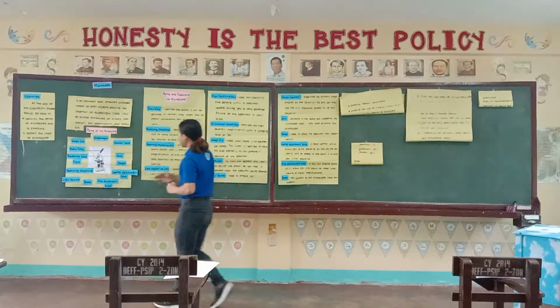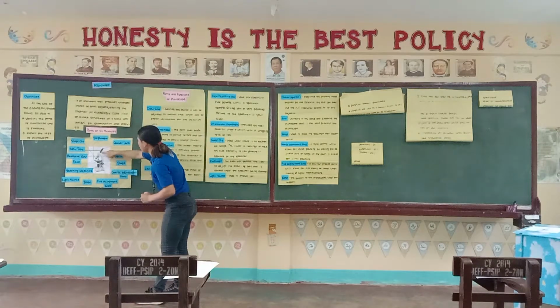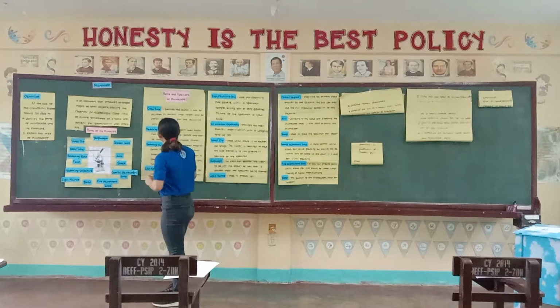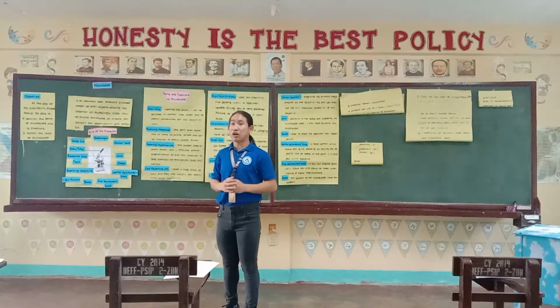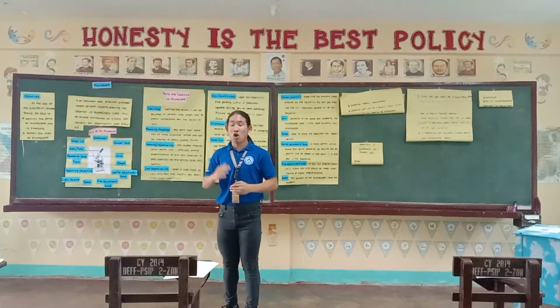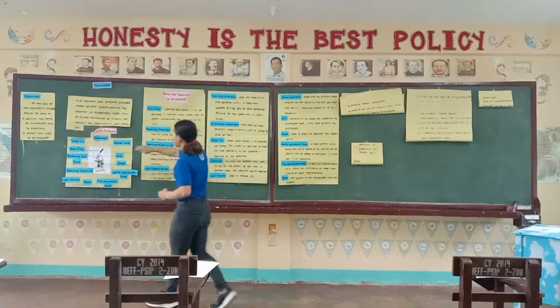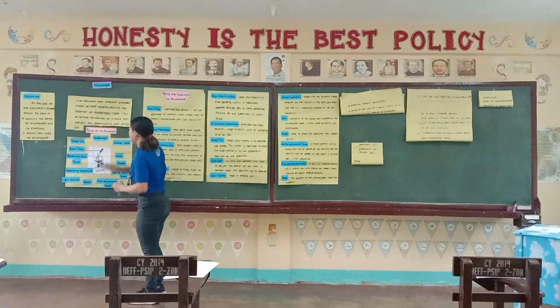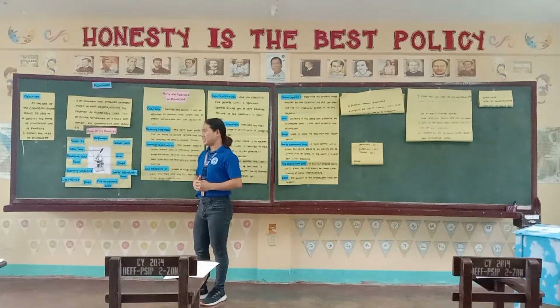So, class, over here in the illustration, this is the body tube or the draw tube. It carries the ocular so that the observer can adjust where to view, examine, or analyze a structure in cells. So the body tube is very helpful for the observer to adjust where to look at the cells.